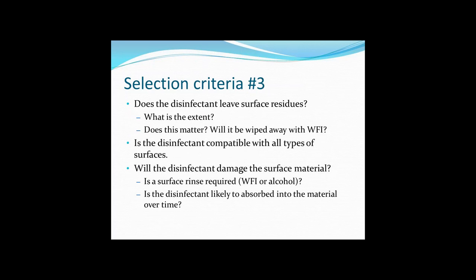We also need to consider whether the disinfectant leaves surface residues and whether we're worried about this. If it does leave residues, to what extent, and whether we need to wipe those away with water. Now, some disinfectants, such as hydrogen peroxide, will break down into water and oxygen and are non-residue, they do not leave residues behind. Whereas perhaps a chlorine-based one may leave a residue, and a decision needs to be taken about removing that residue or not. In most cases, it's good advice to remove the residue.